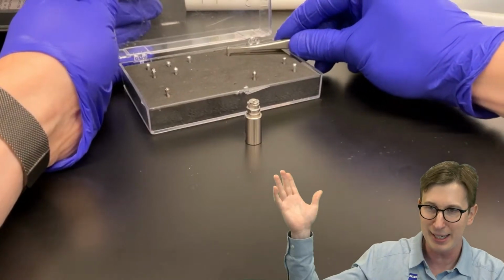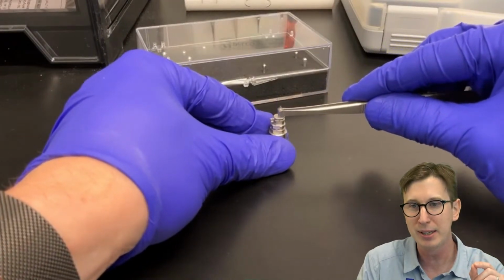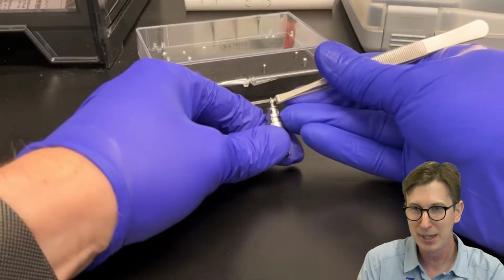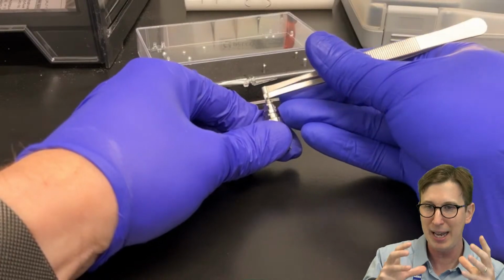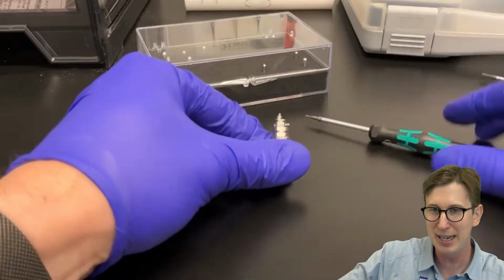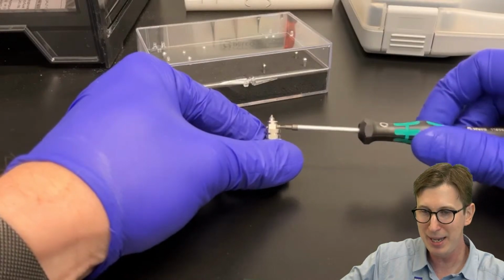You can see I could keep a variety of different samples on the pins. And this gives you an idea of the size of the sample we're working with. So we're typically looking at about a cubic millimeter of tissue that is mounted and stained and brought into a plastic resin. So that has been prepared ahead of time, and I put it on top of this pin, and the pin simply slides into the sample holder. And now I'm tightening the set screw to lock that pin in place.